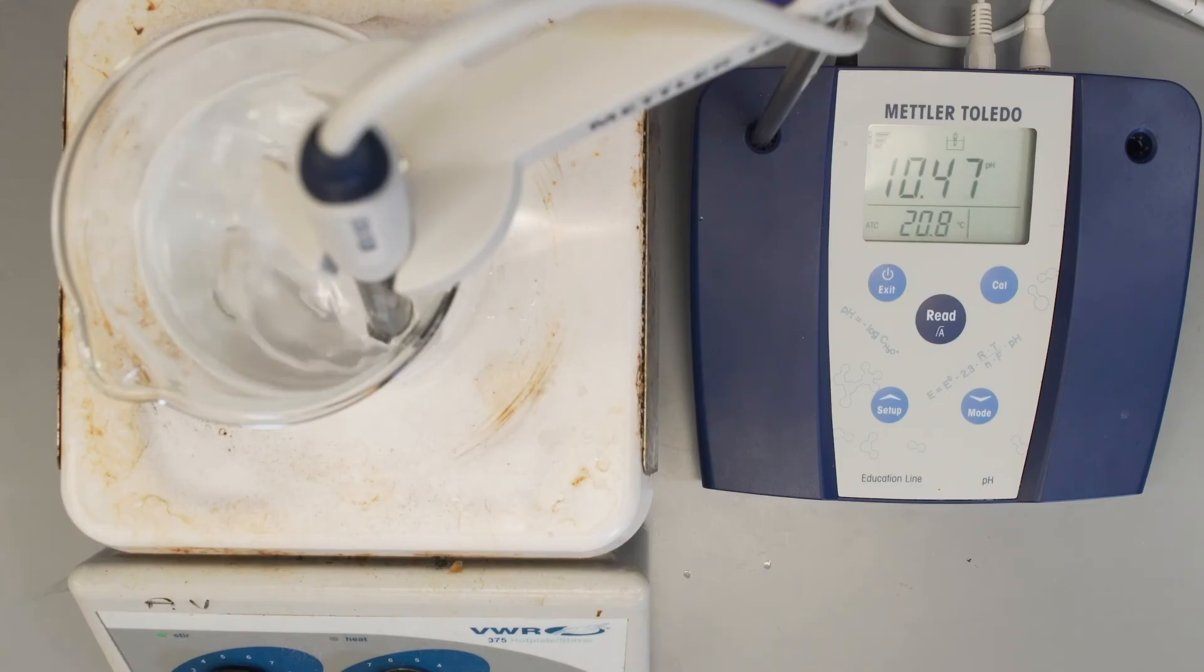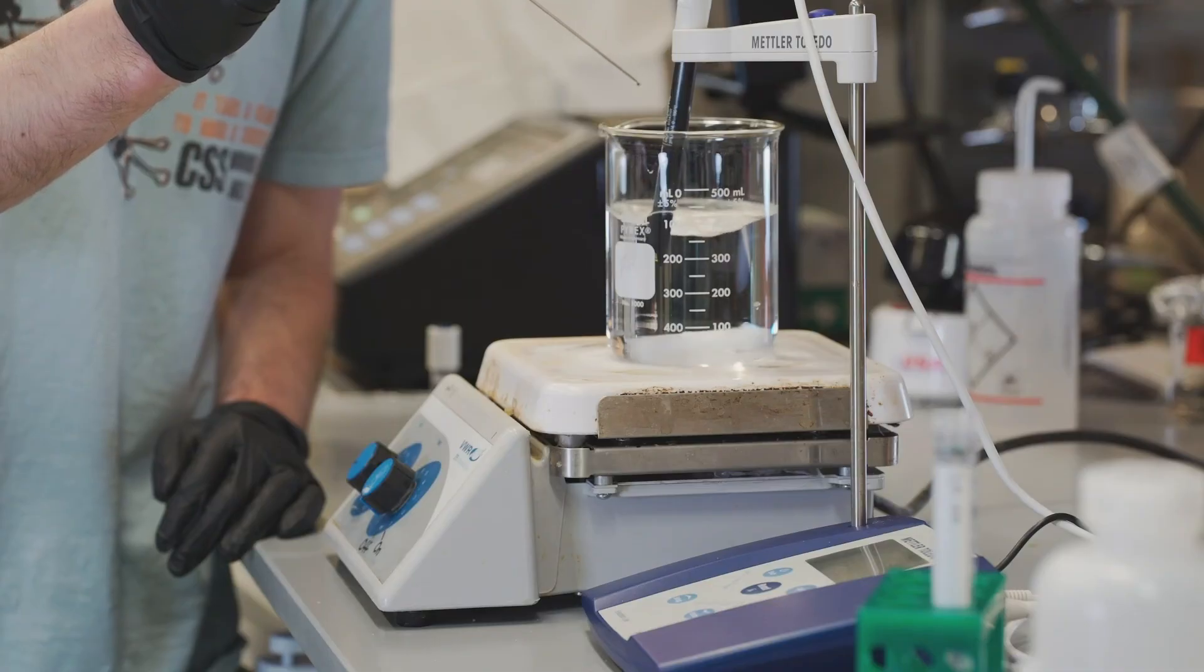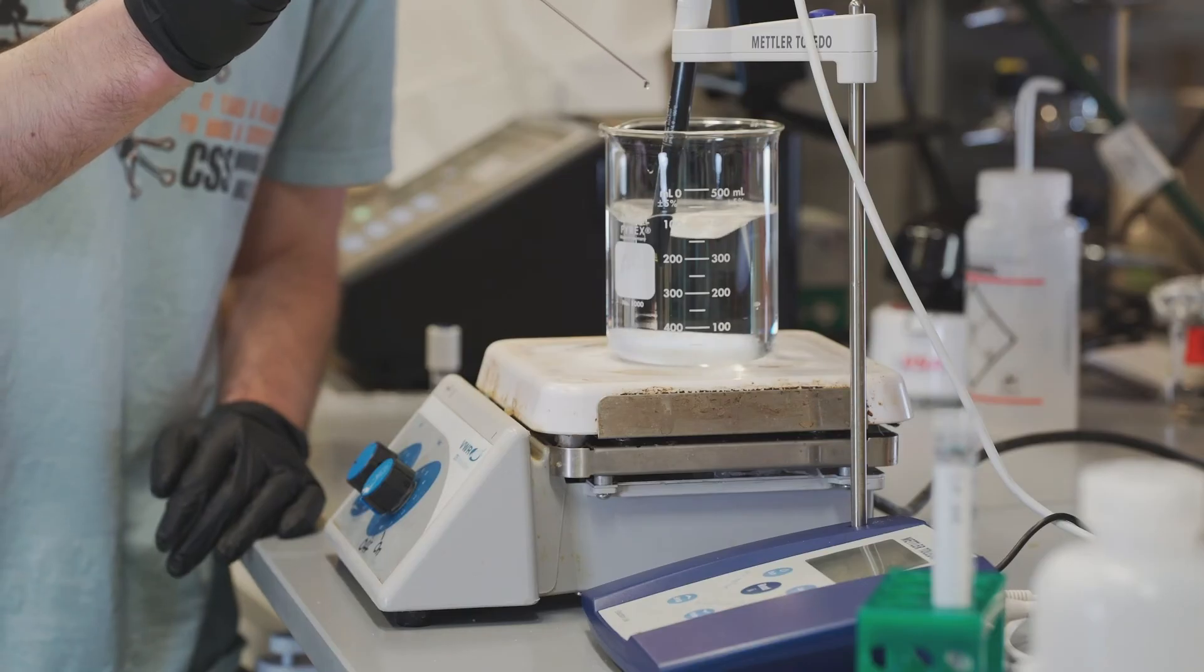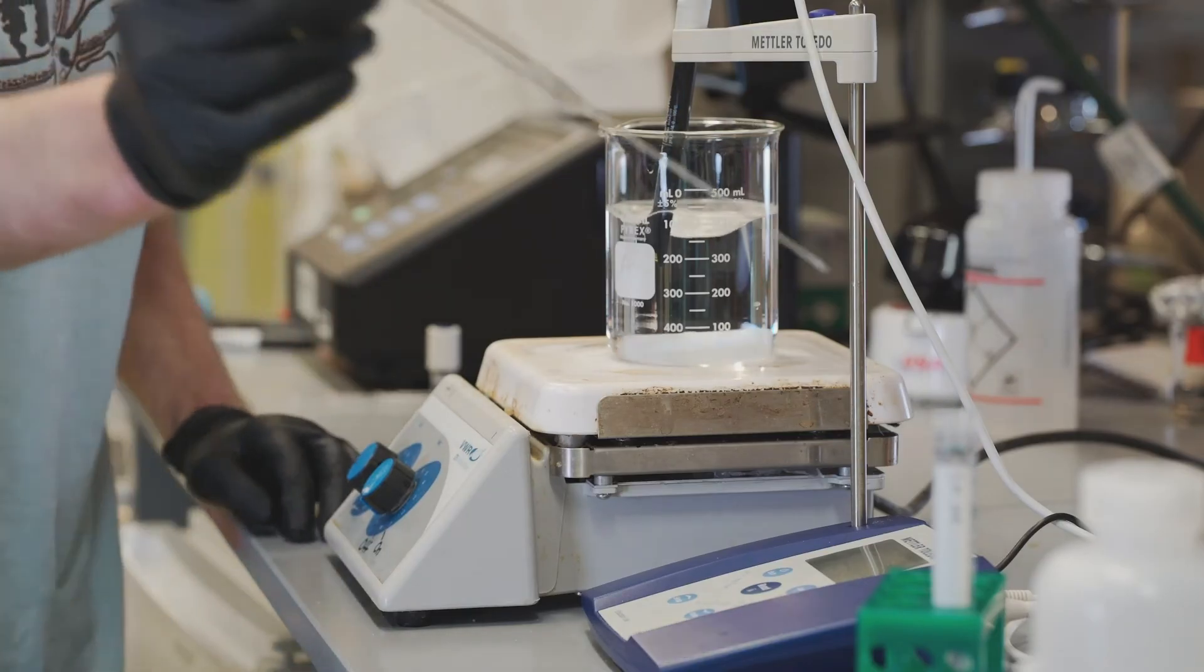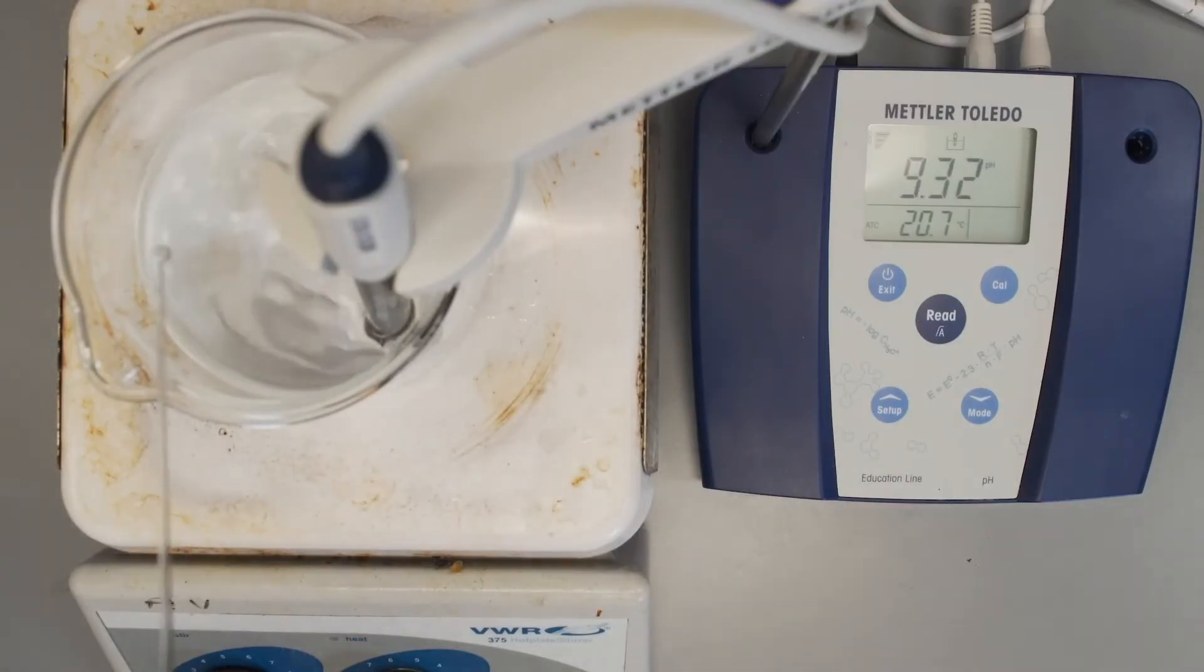But for our experiment, we need the Tris buffer solution to be at pH 8. So we're going to add drops of hydrochloric acid to get it down. The pH meter will help us keep track of the changes in pH as we add the acid so that we don't overshoot our desired pH. As the drops are added, the pH meter reading decreases gradually until we reach 8.